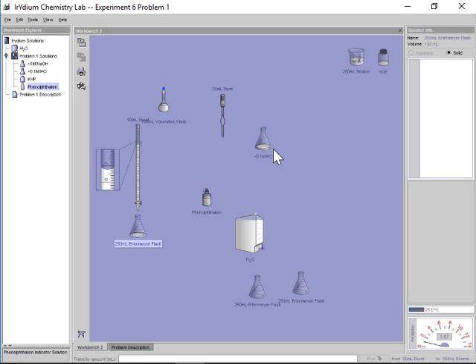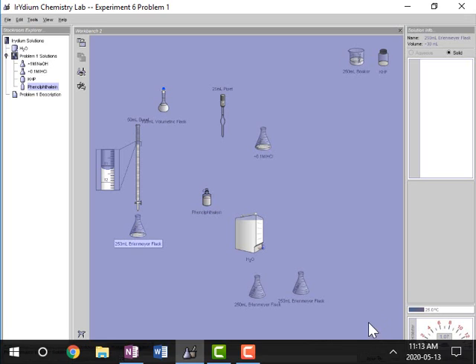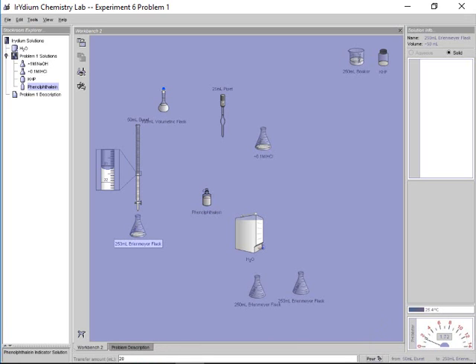Again, just like we just did this, right? It's just good practice for you to do more titrations. I know I have about 25 mils in there. This time I'm going to safely toss in, let's say, 20 mils. So pour in 20 mils. That shouldn't be any problem. So it doesn't stay pink color. That means I still have leftover acid. I know it's going to be somewhere between maybe 21, 25 or so.